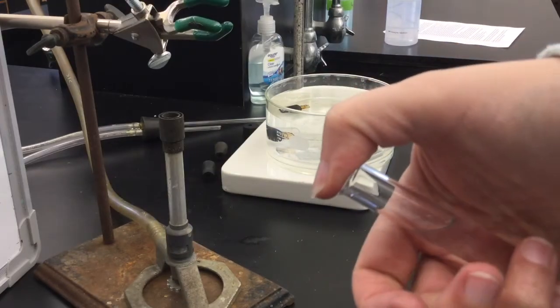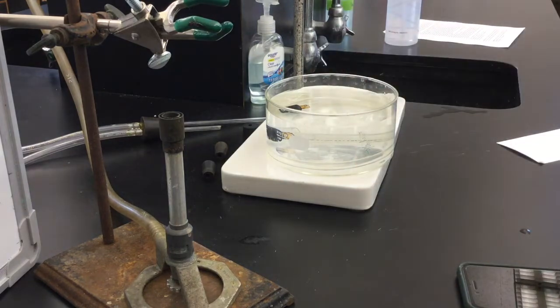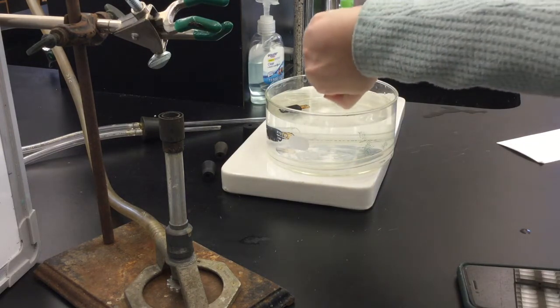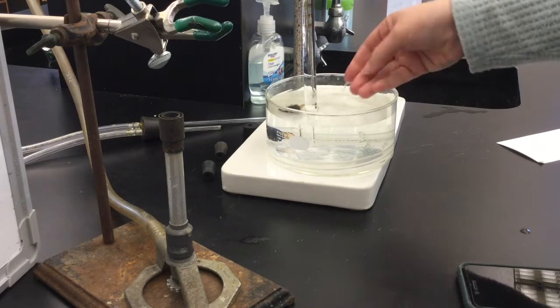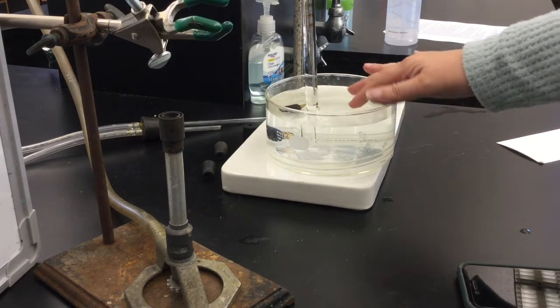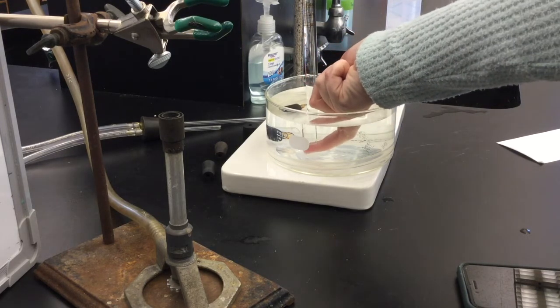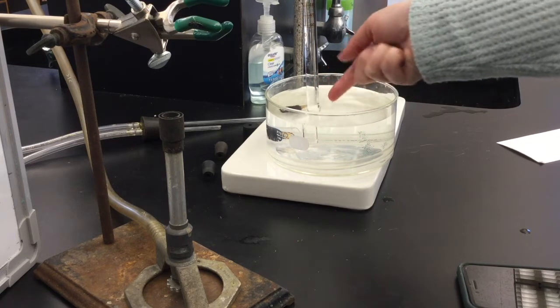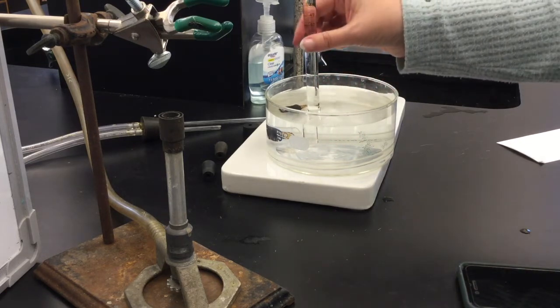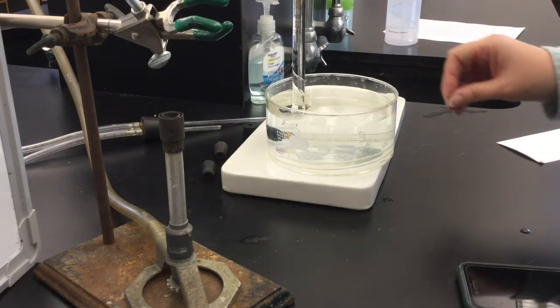Cover the end of the eudiometer with a thumb or finger so that the water doesn't leak out, then invert it. Attach it to the burette stand, letting go only when the mouth of the eudiometer is below the level of the water. Now you're going to need to get the tube in there, so you may have to adjust the height once it is attached. This to me looks like it is a little bit too low. I don't think I can get the tube in, so I'm going to adjust this. Also make sure that you turn the numbers so that you can see them.